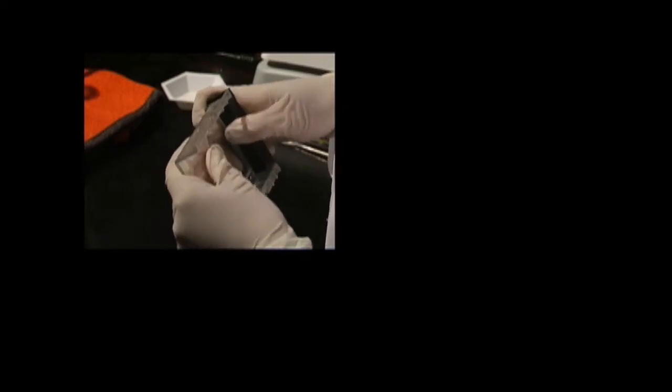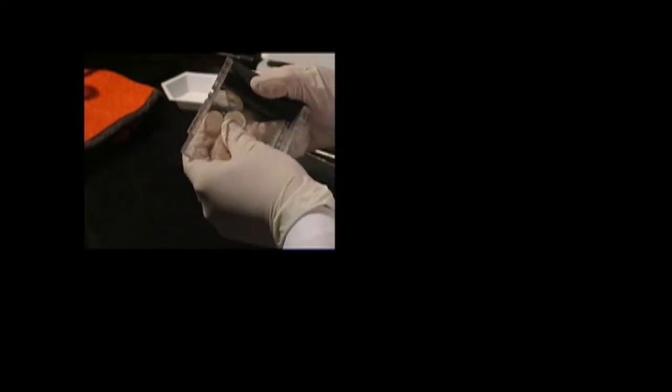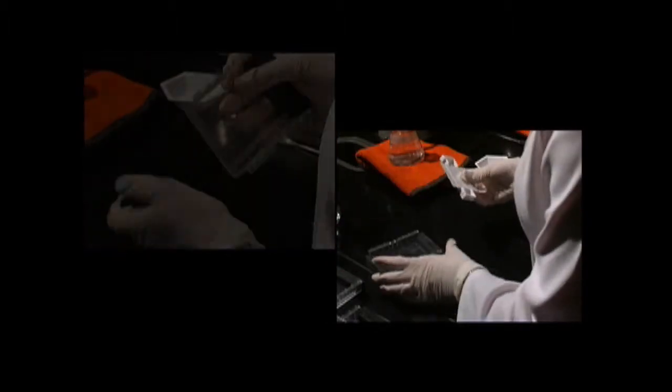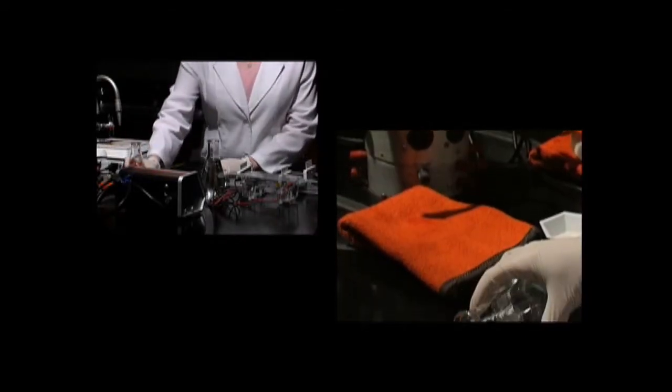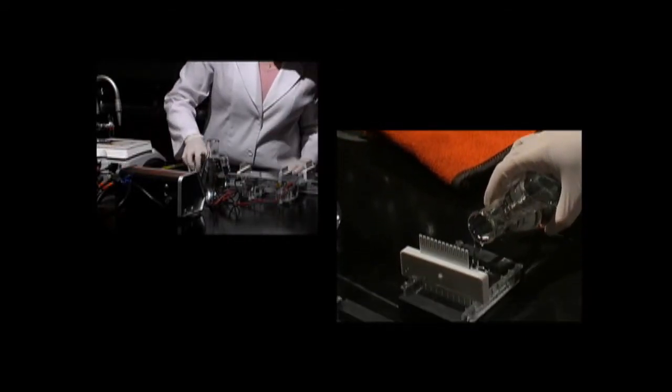To prepare the gel bed, first close off the open ends using rubber dams. Make sure that the bed is clean and dry. Place a well-former template, known as a comb, in the first set of notches nearest the end of the gel bed. Make sure it's on a level surface, and pour the agarose solution into it. Allow 20 minutes for it to solidify.